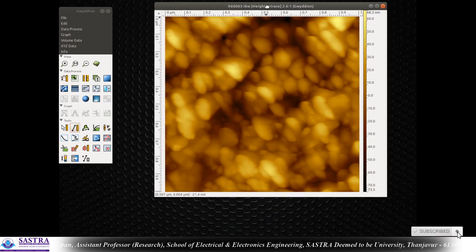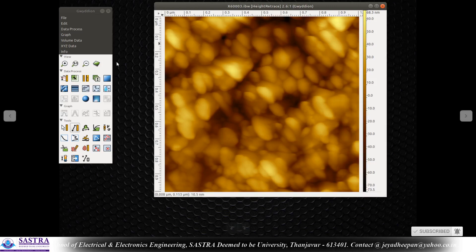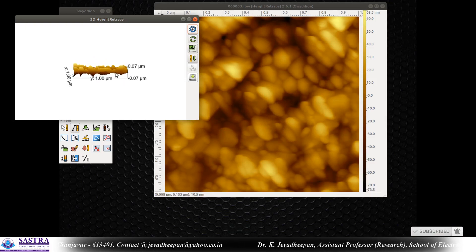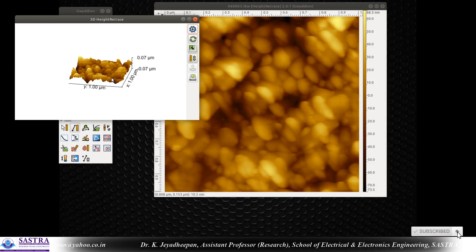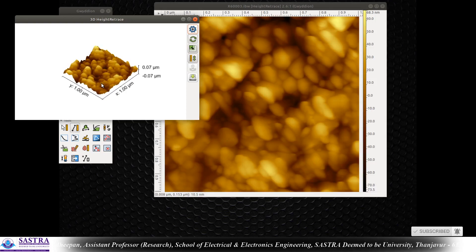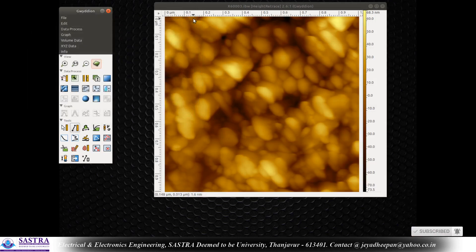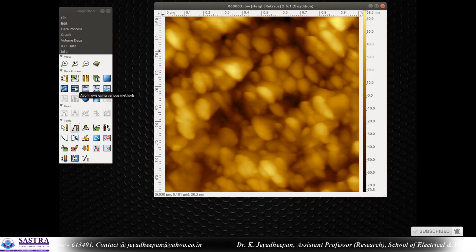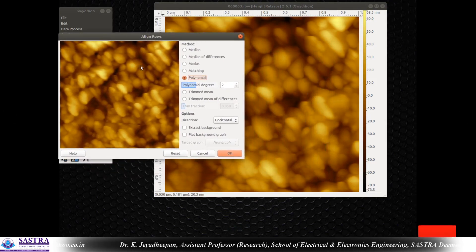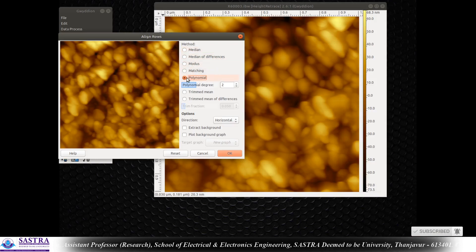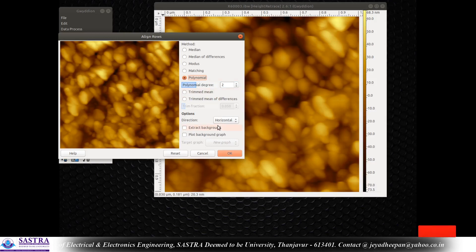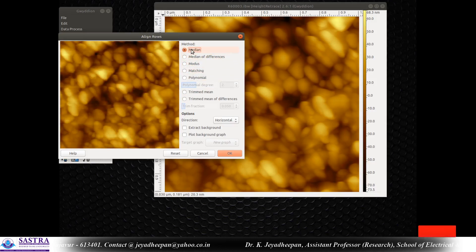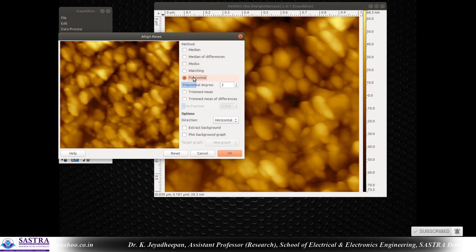First thing is we have to process the data. Sometimes if you see it as a 3D view, the data will not be in a plane — sometimes there will be a hump-like structure or a slope-like background structure. You have to correct the background. To do that, press the icon 'align rows using various methods.' You can select any of the methods — matching, median, differences — I'm taking the polynomial function as a method.